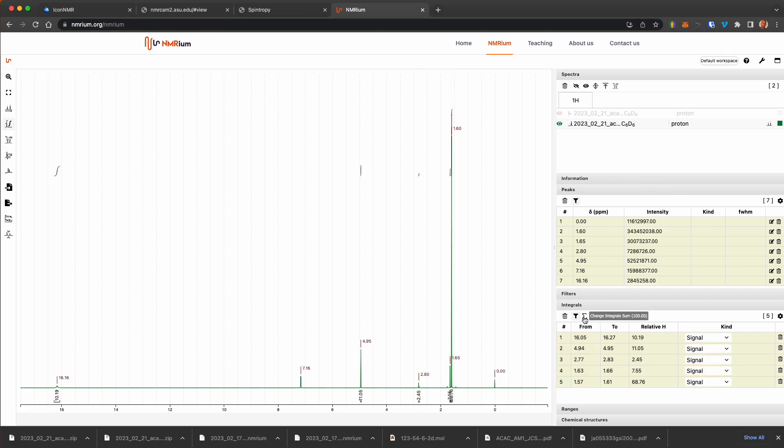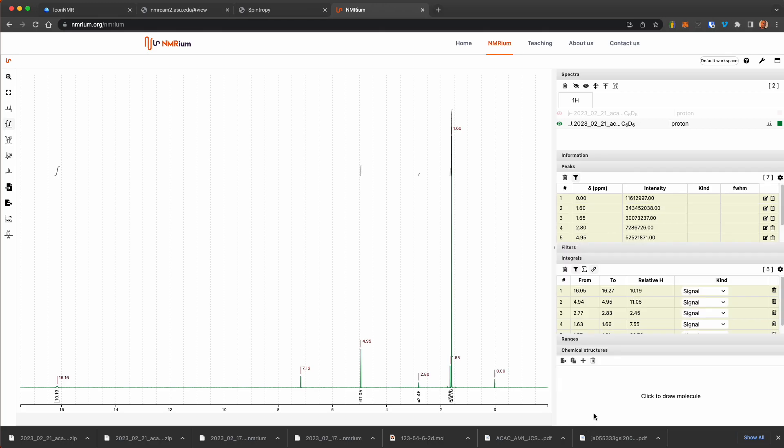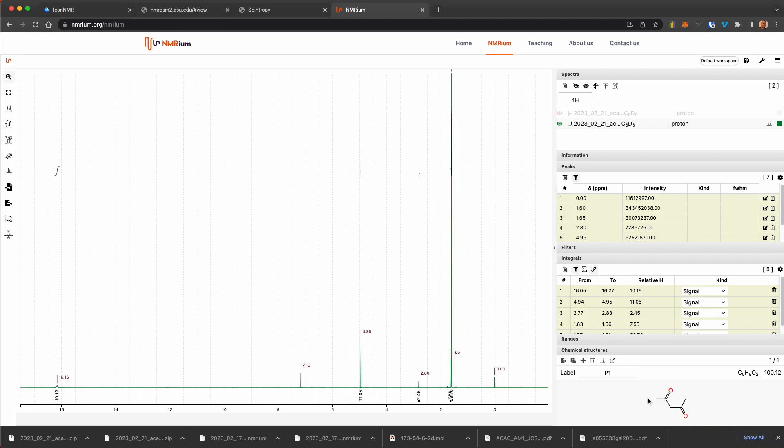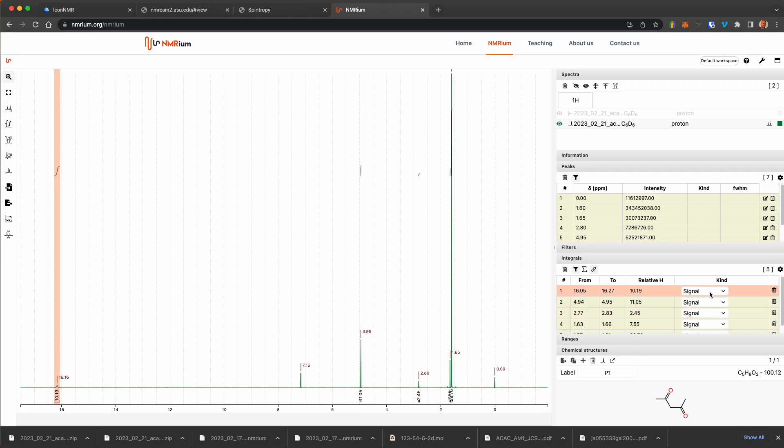So now we have integrals. We can make those relative by telling it the integral sum of each of these. And we can even, to help ourselves, give it a molecular formula. It tells you that you can add the molecule in a mole file. So I've got acetyl acetone. I get the mole file. And here you go.